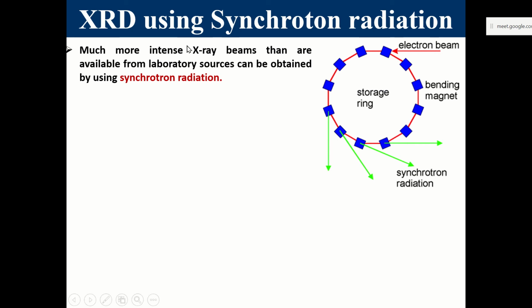So, in the last few classes, we had discussed X-ray diffraction. The different aspects of X-ray diffraction were discussed, and so we learned about the Miller indices. That's the starting point. Actually, when you start describing the X-ray diffractogram, try to understand the lattice planes.